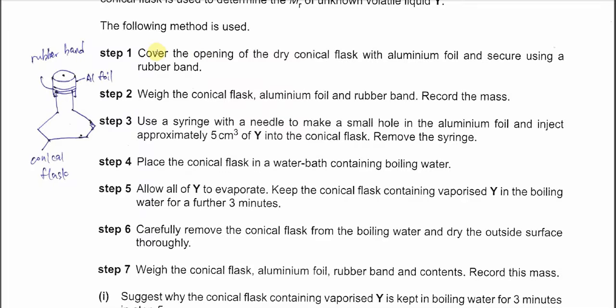First, cover the opening of the dry conical flask with aluminum foil. Secure using a rubber band, something like this. Put the aluminum foil on this conical flask, then use the rubber band to secure the position. And step 2, weigh the conical flask, aluminum foil, and rubber band together. Record the mass before the injection of the sample.